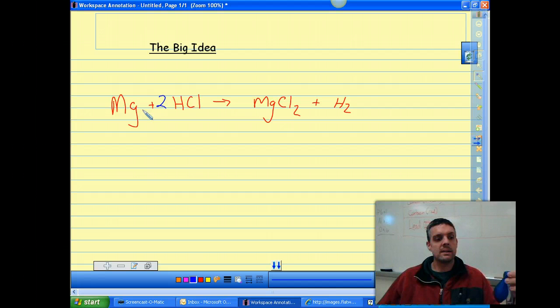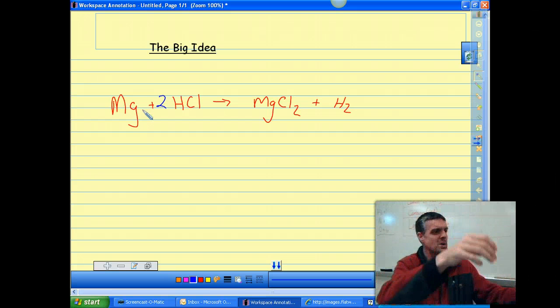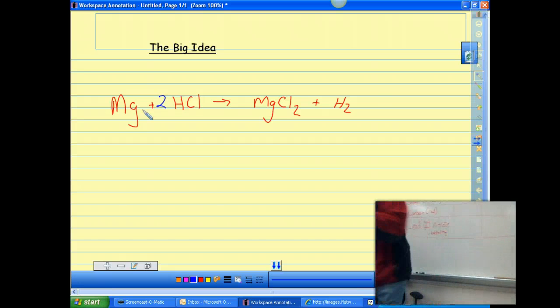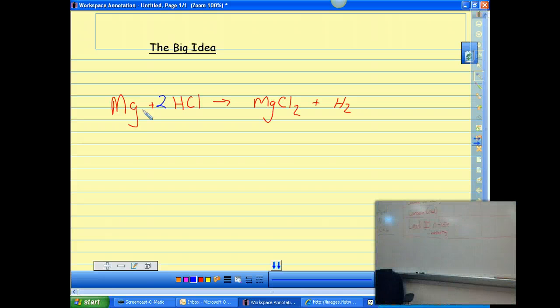And so here, we'll go ahead and pour this in and see what happens. If I drop it and get sent to the hospital, you'll know because I didn't do any math first. Oh boy. Okay, that got really hot. So hold on a second, I'll be right back. I've got to get something to handle that with.